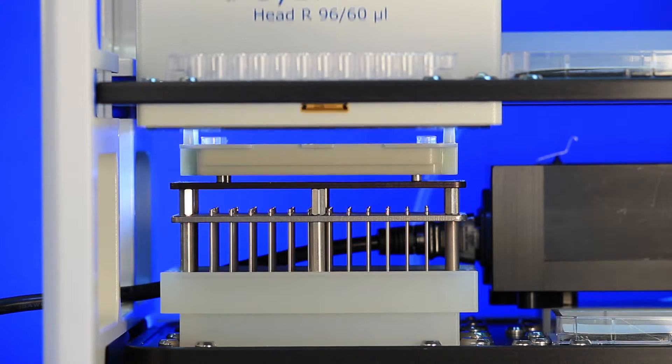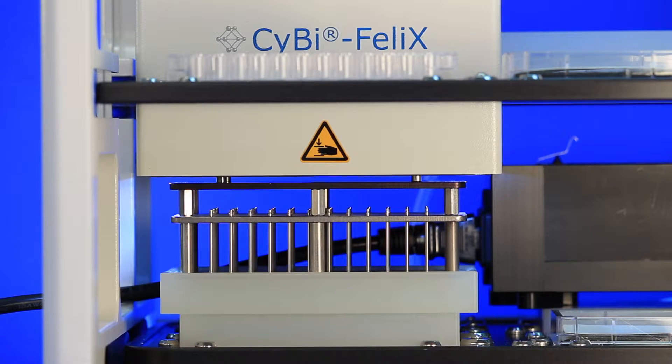The pin tool is picked up by the robotic head. We make different mounting plates depending on the liquid handler you are using.